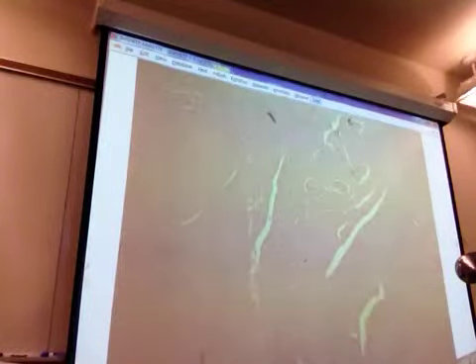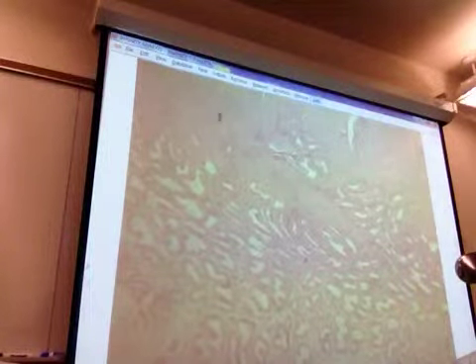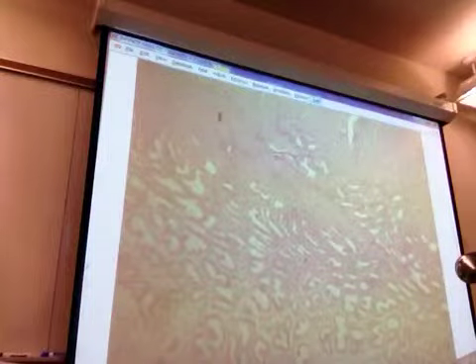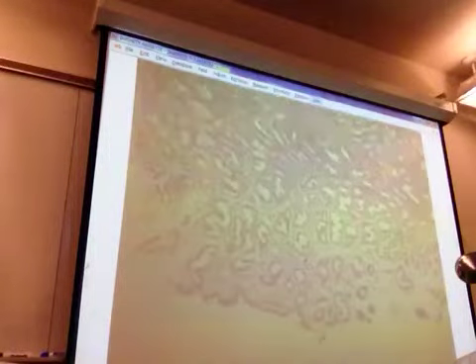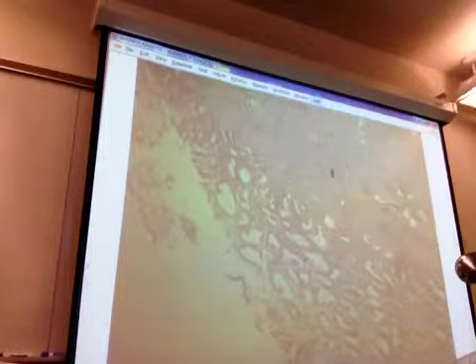Muscle, muscle, muscle, muscle, muscle. Guess what? Glands. Who said secretory? Why did you say secretory? Because the glands are big and open. Good. Many, many glands, big and open. Glands look more complex as well. And very complex. Yes.